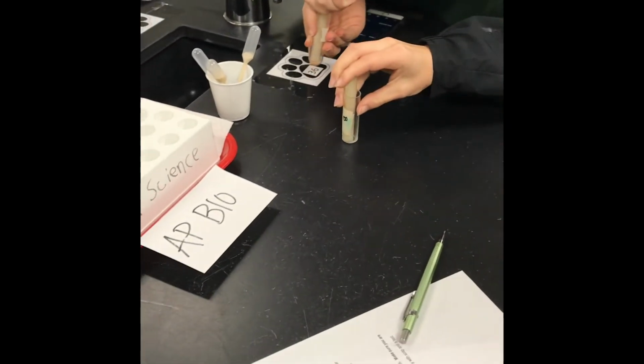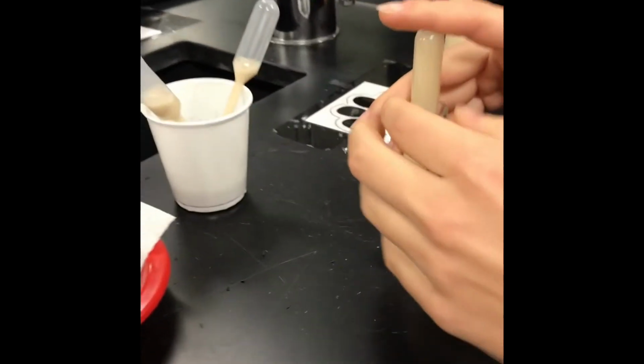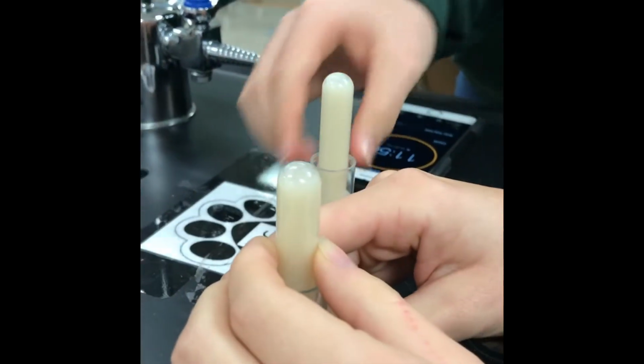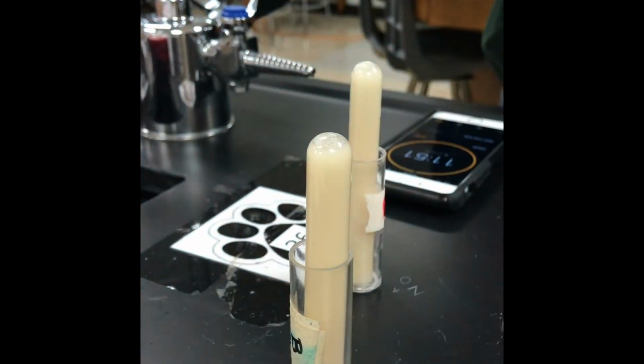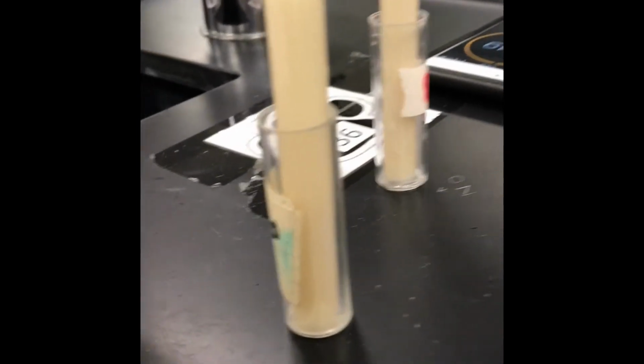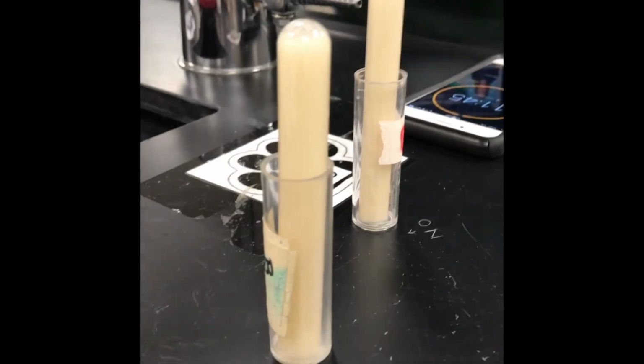Isn't that the coolest thing you ever saw? Stressful. Oh, and then start the timer. Timer started. They did a beautiful job, so look at this. They're upside down, and they're going to start their timer. And after a couple of minutes, they're going to measure the height of carbon dioxide bubbles that forms at the top of the tube. So stay tuned.